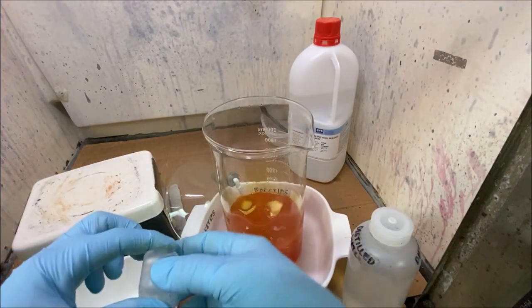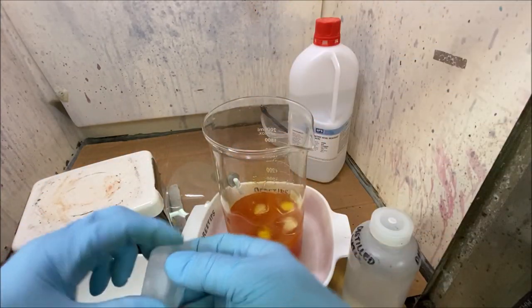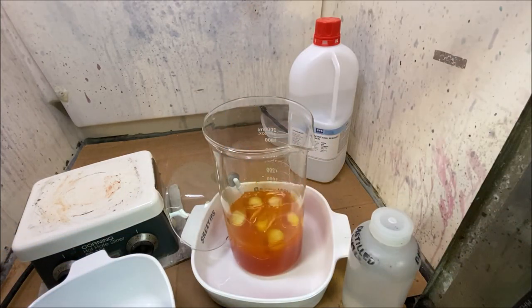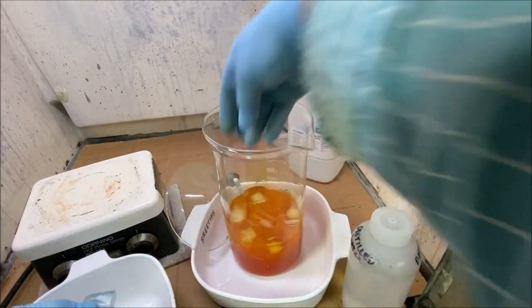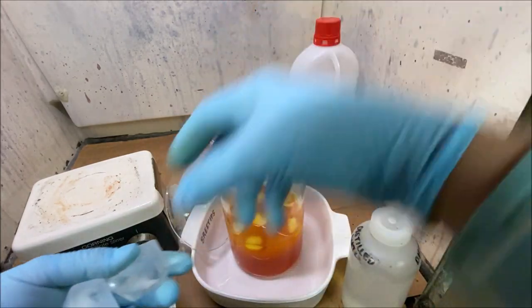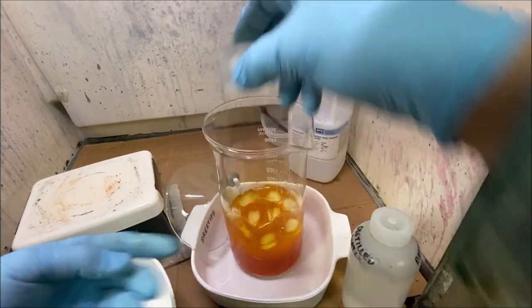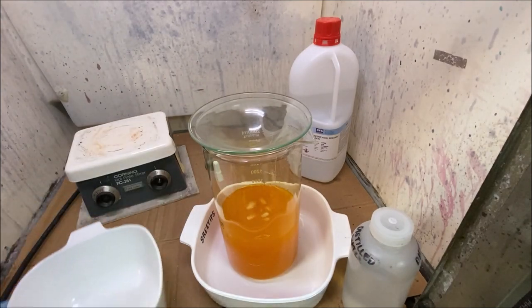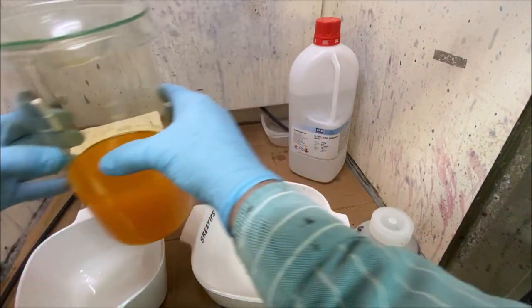You see the solution's cloudy. That means we do have some contamination in there. That's why we're doing this refining, to get that cloudiness out of there. Probably silver chloride. Let's get set up with a filter flask and filter our solution now.